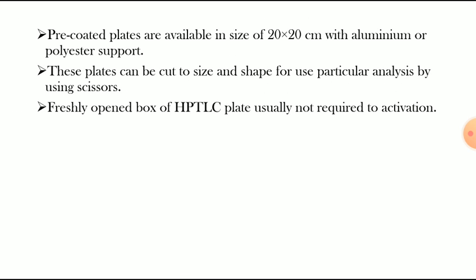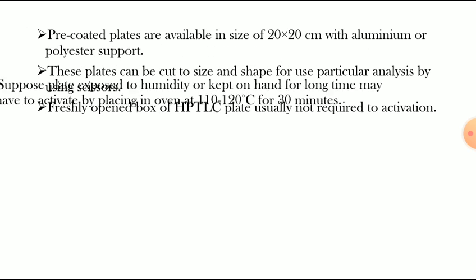A freshly opened box of HPTLC plates usually does not require activation. See, in the previous lecture we have seen the activation of the HPTLC plate. Suppose the plate is contaminated by some impurity, or by humidity, that plate should be activated, and then we can use it for analysis of the sample material.